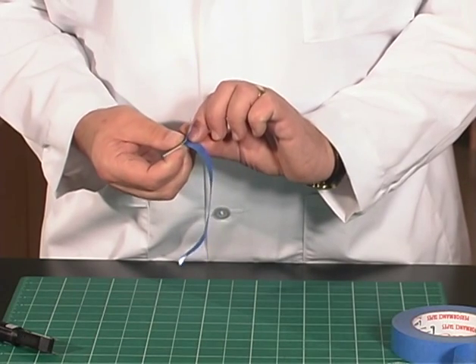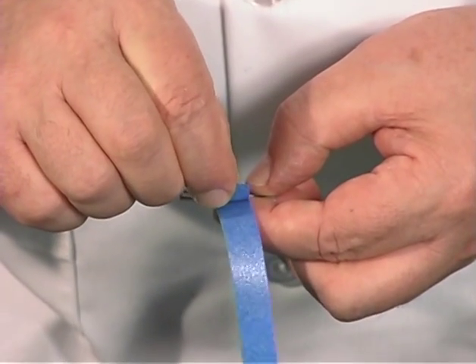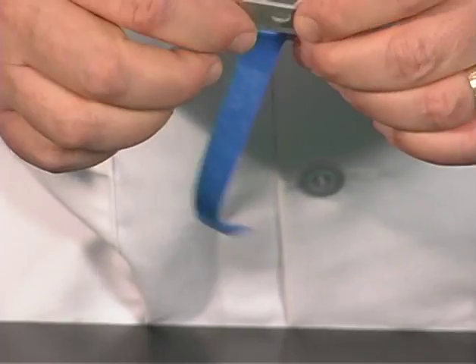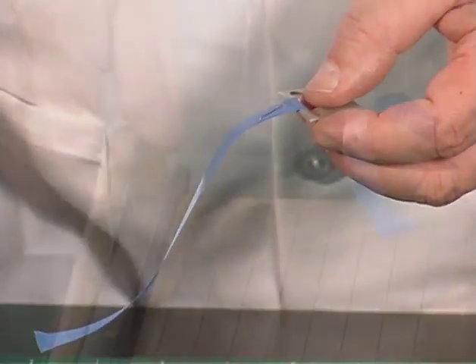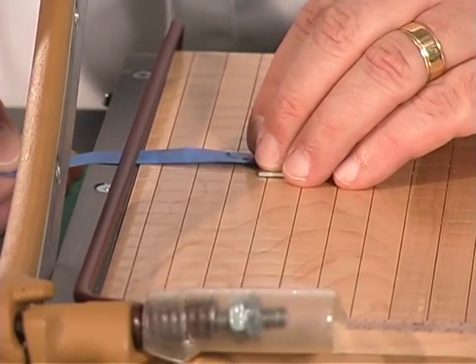Carefully wrap one end of the specimen around a clamp, making sure it's in the center, and secure the sample with a stapler. Cut off the excess tape so that the specimen is approximately 50 millimeters long.